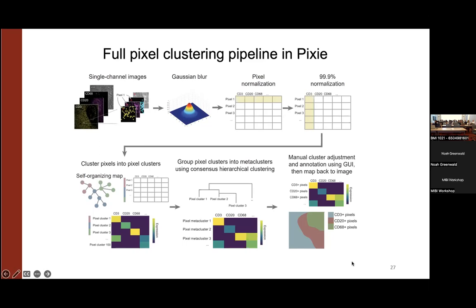So you talked about pixel clusters to identify these acellular or hard to segment features. What is the subsequent step to actually use that? To generate a mask for those objects? Is it counting the number of them in images? What are some ways you could take microglial projections or tau features and then actually use that for your analysis? Yeah, that's a good question.